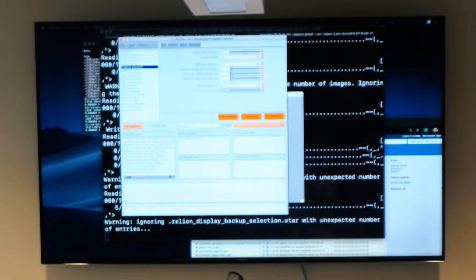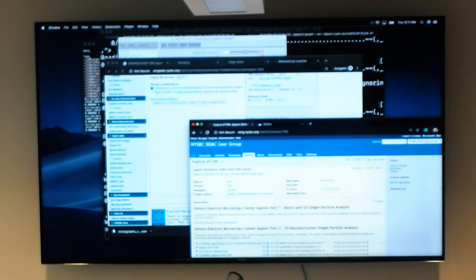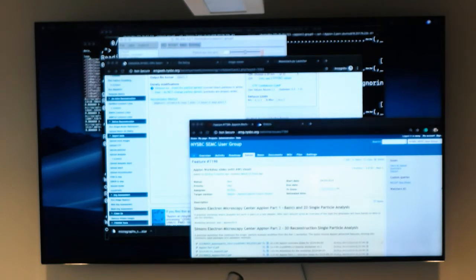Okay, so something that we're working on here is on demand. We can make use of certain. Is that website? I have sent you the Slack. Through Slack. So this is not released yet, but through NCCAT, we have noticed that a lot of our users don't have sufficient computational resources in their home institution.